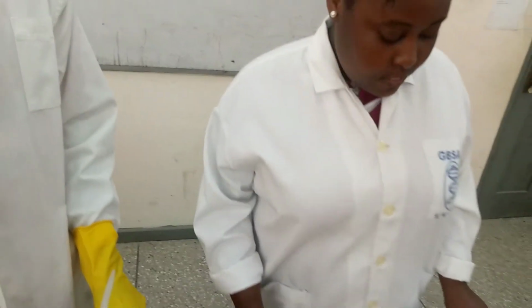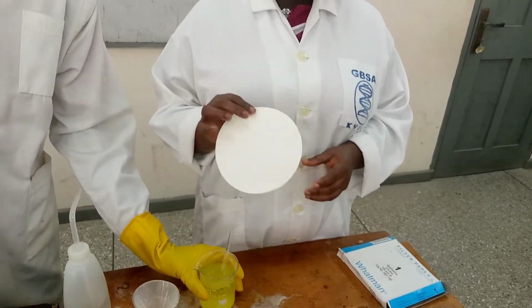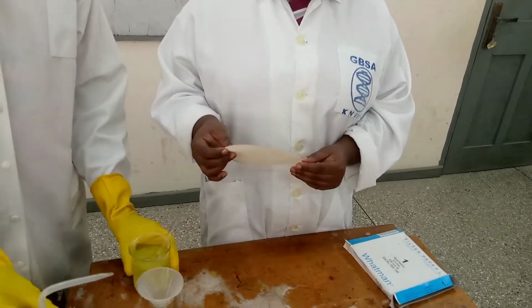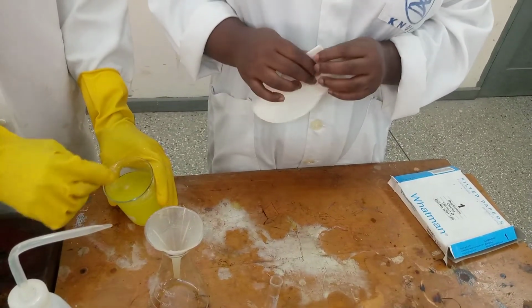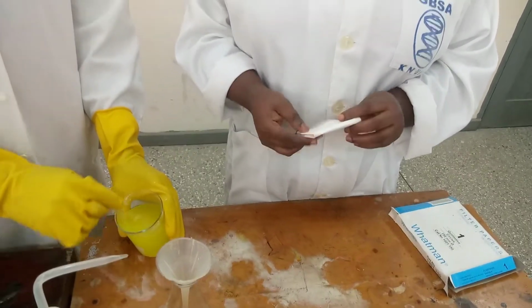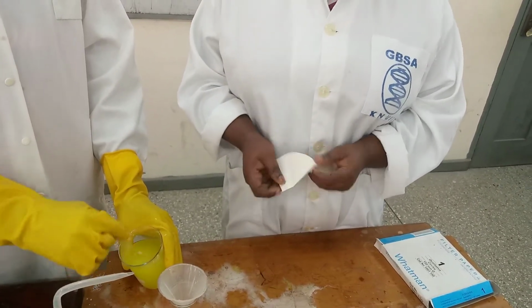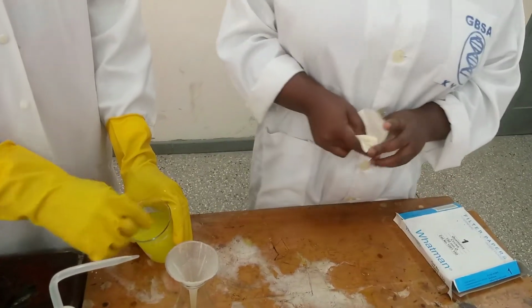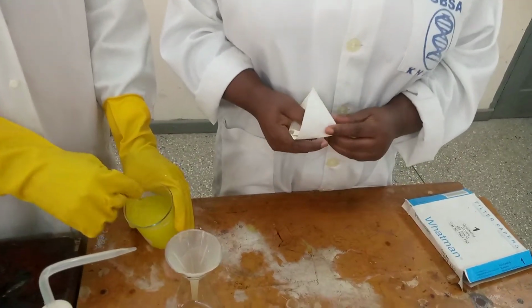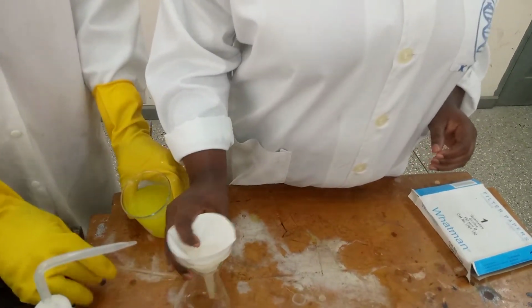Alright, so I have here filter paper. In one of my videos I showed you how to fold filter paper. So you fold it like that, like a cone. Then I have my funnel here, so I'm going to put it in my funnel.